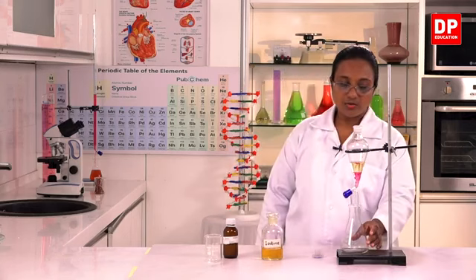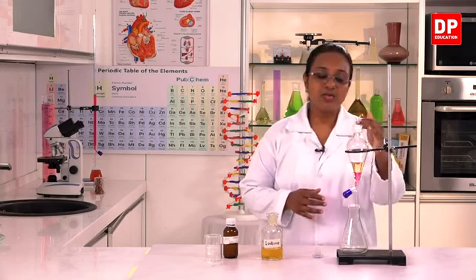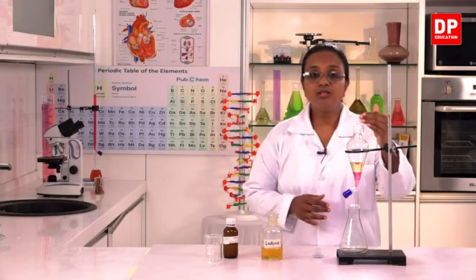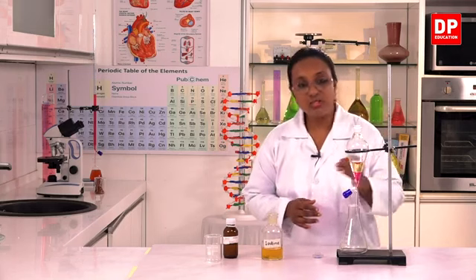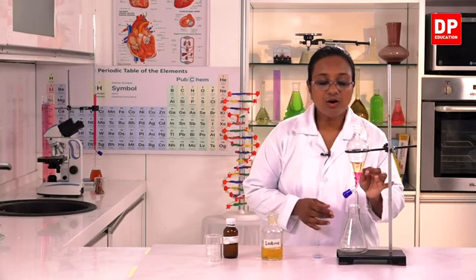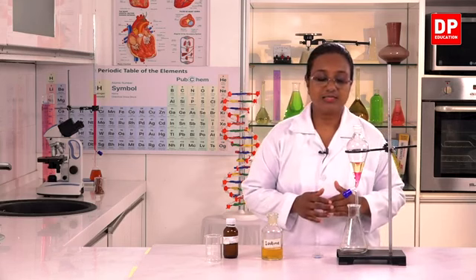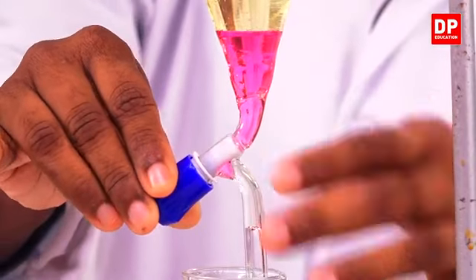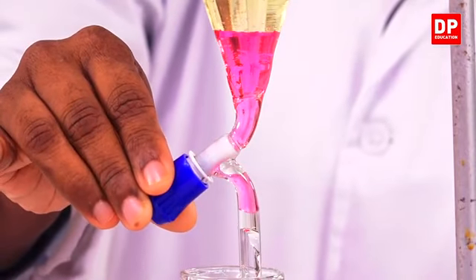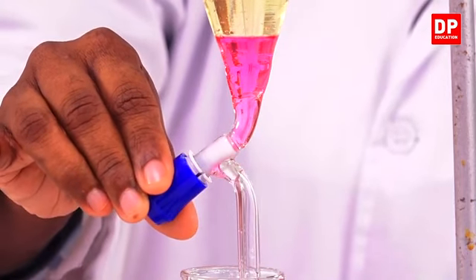So what we can do is, now we have separated the solute. That is, we have extracted some of the iodine into the carbon tetrachloride solvent. Now I will have to separate the two layers. To do that, I will open the tap. Only the pink color layer will flow into the conical flask.